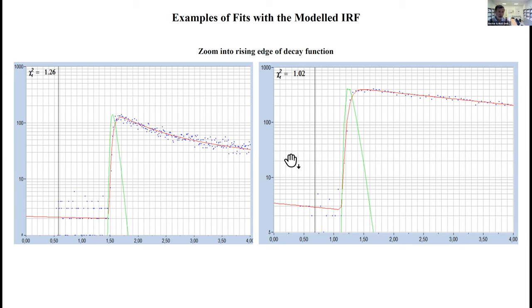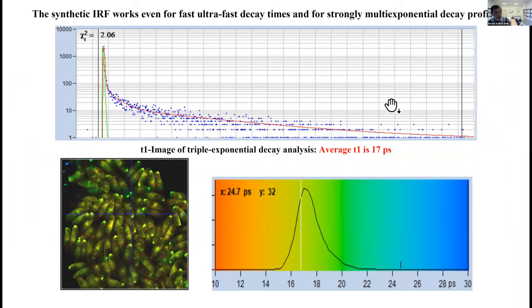Here are examples. This is a strongly multi-exponential decay. This is our modeled IRF function. You see how nicely the convolution of the model function with this IRF matches the data. This is the same thing for a slower single exponential decay. It's even more surprising that the whole thing is working even for extremely fast fluorescence decays. This is a decay function of mushroom spores with a lifetime component of only 17 picoseconds. Even for such data, our IRF modeling delivers a reasonable IRF and the correct lifetimes. So the second point is solved.